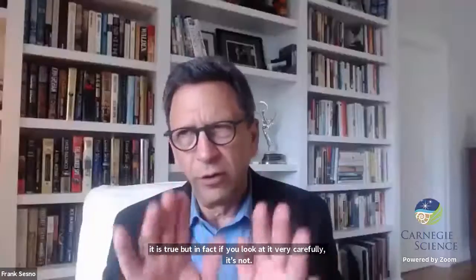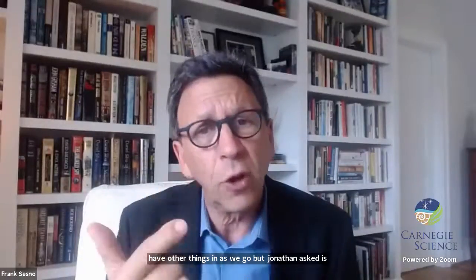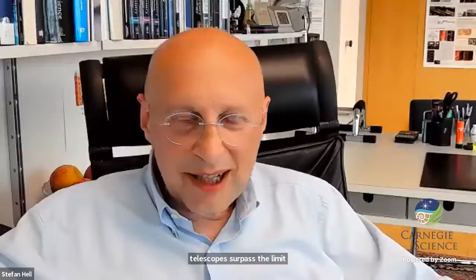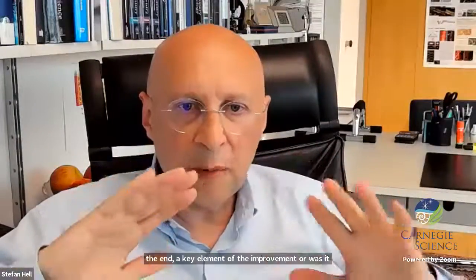We have some very good questions from the audience, so let me go to some of those now, and we'll weave other things in as we go. But Jonathan asks, is there some variant of this technique that can help telescopes surpass the diffraction limit? It's a very good question. The answer is, I doubt it. I think the answer is no, because in the end, a key element of the improvement of resolution is that we turn molecules on and off.